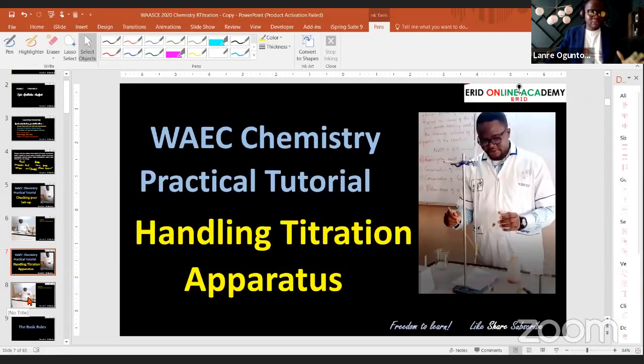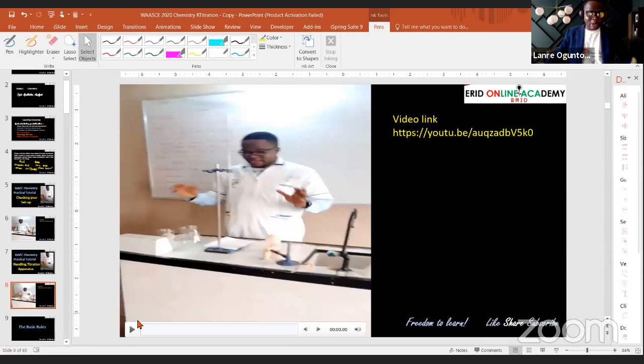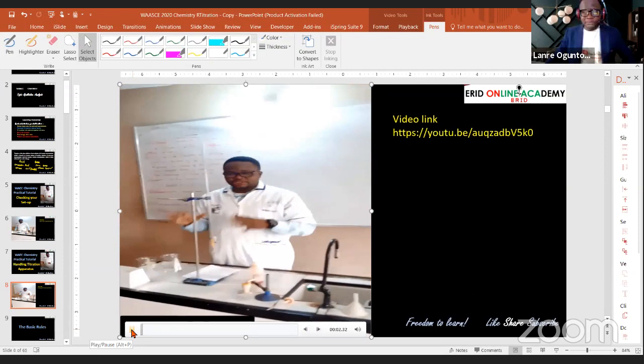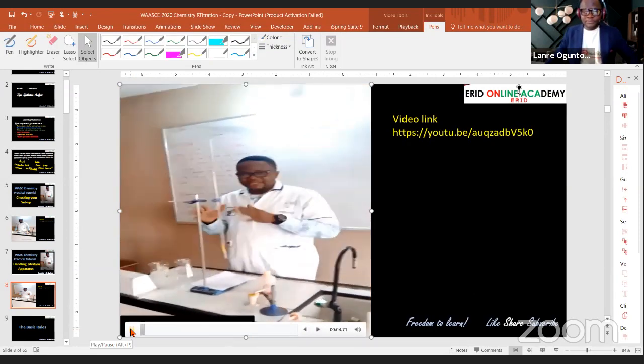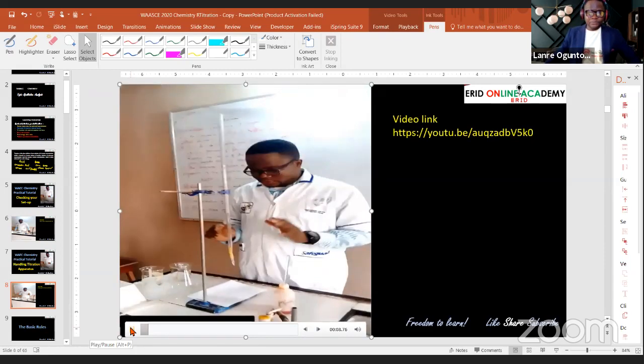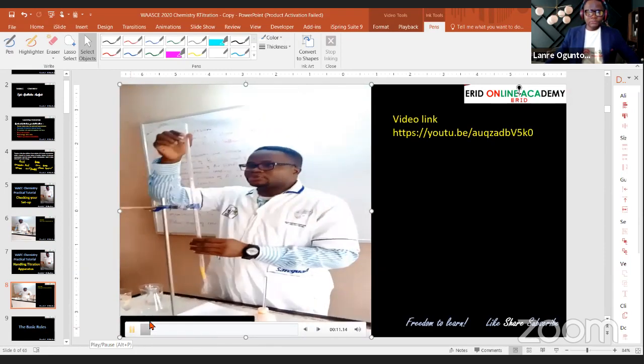So how do you handle laboratory apparatus? Okay, so I will explain quickly to you how to handle your burette and your pipette. I need you to listen to these two carefully. About the management of this setup, how do you keep your purity level so that you can have accurate titre value? So it's important that you know about your burette.